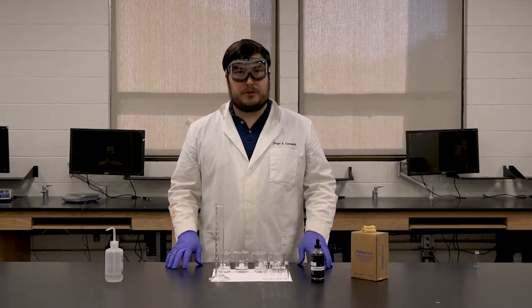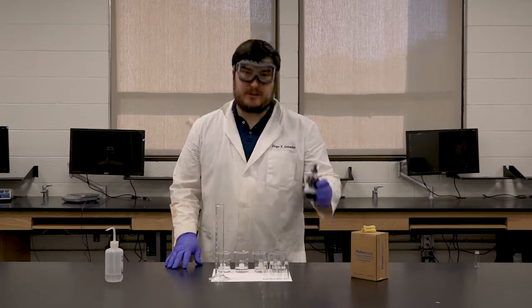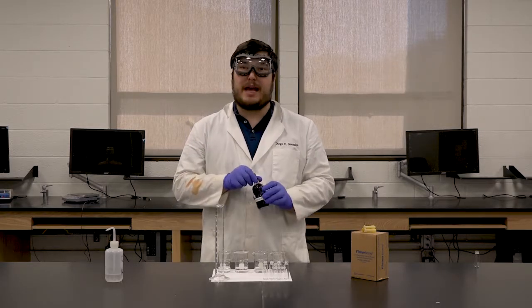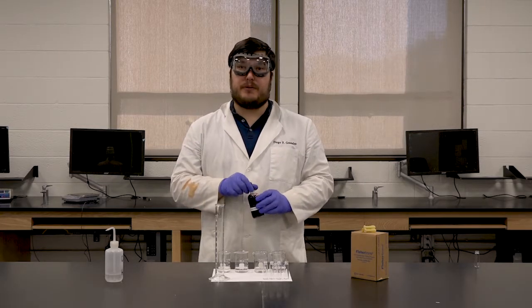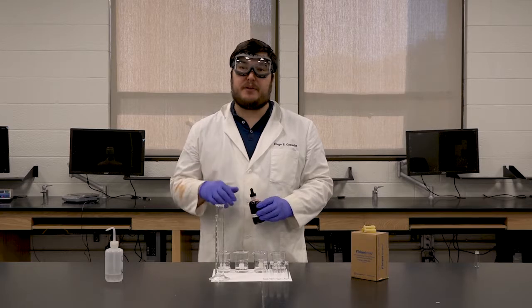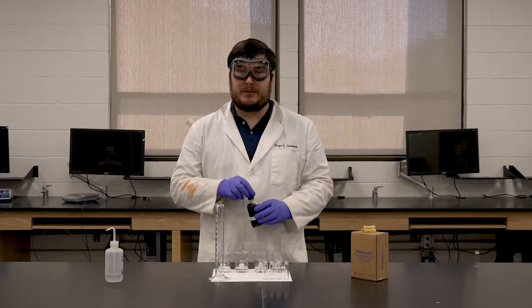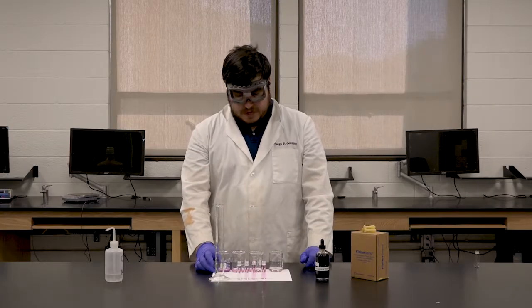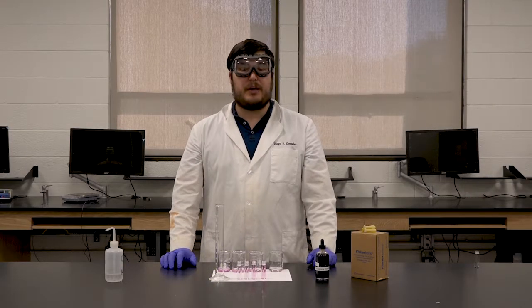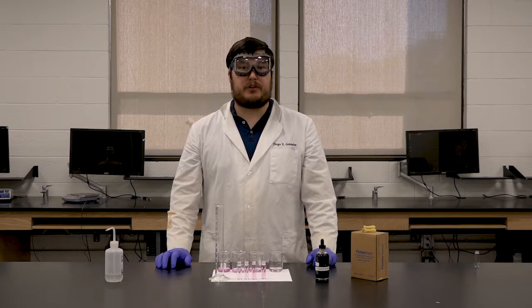Now with the 4 beakers and the 20 mils in each beaker, we're going to go ahead and take our potassium permanganate solution and add the drops that are indicated by the experiment in our lab report. For this instance, I'm going to be placing half the amount of drops that is normally dictated by the experiment. Now we can go head over to our spectrophotometer and complete the second part of our experiment for the day.